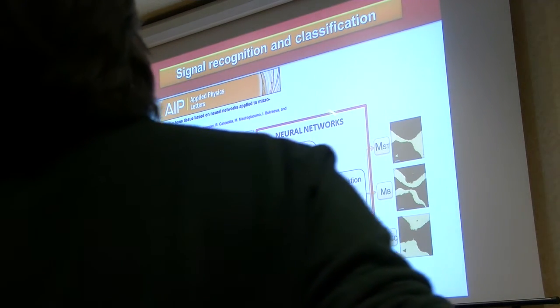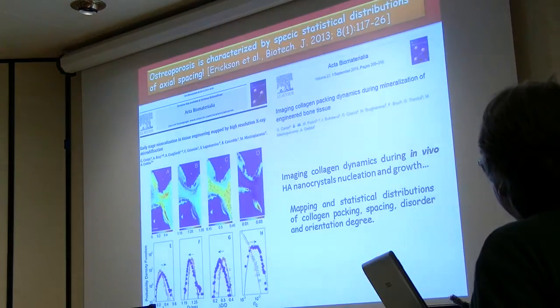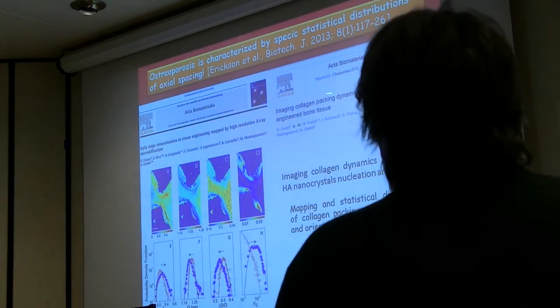In this way we have written a neural network algorithm to classify the different signals and analyze them in the different portions of reciprocal space, obtaining maps of the different characteristics, and in this way we can study the fluctuations of these characteristics at different scales.